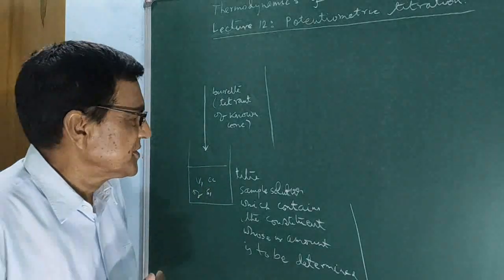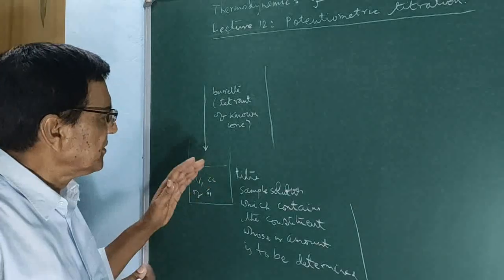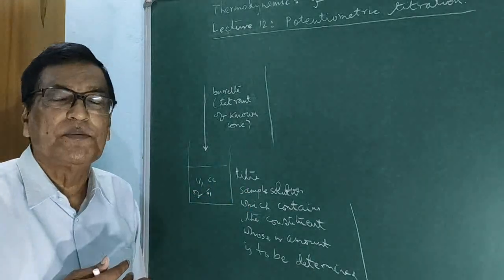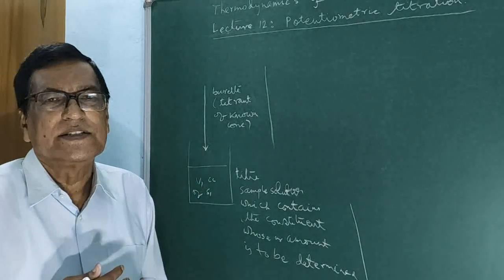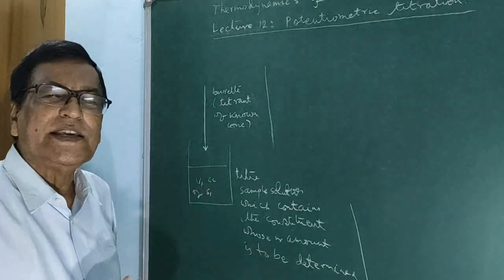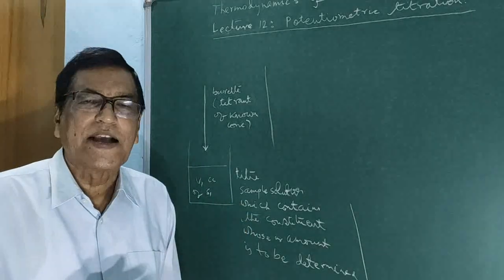We have to choose a suitable indicator so that the signal becomes just near the equivalence point of this reaction.